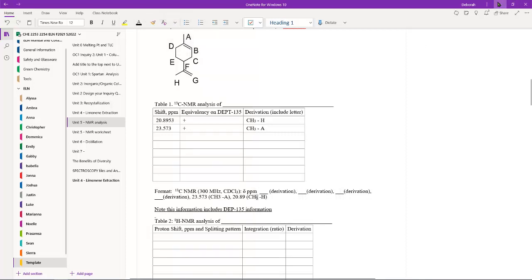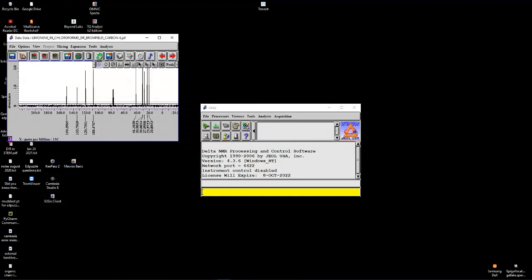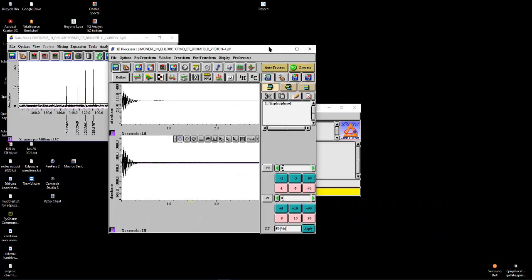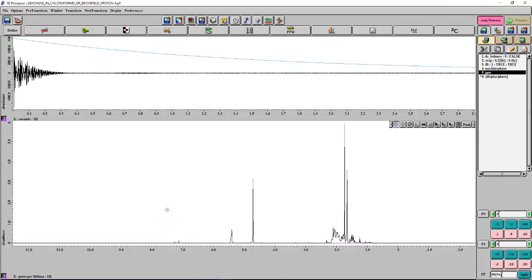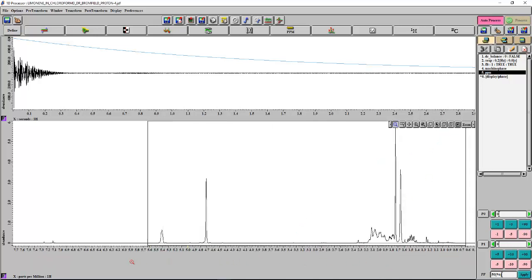We do the same thing for protons. So again, I'll have a talk through, especially the proton, and then you'll do this to finish this up in lab, or you can do it outside lab if you want. So again, the proton NMR may not be processed for you, especially depending on the software, so you have to hit proton auto process. If it's already like this, then it wouldn't matter. I do want you to note something on here. I'm going to zoom in.